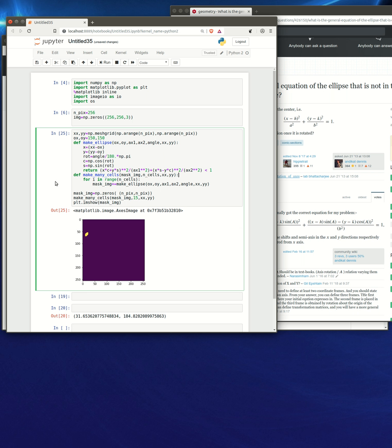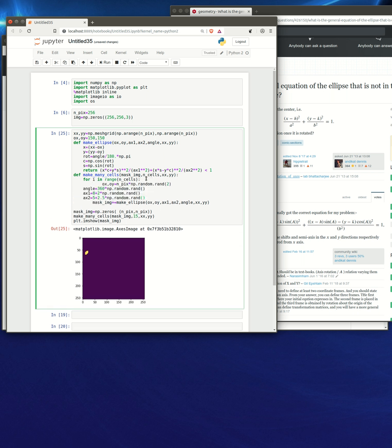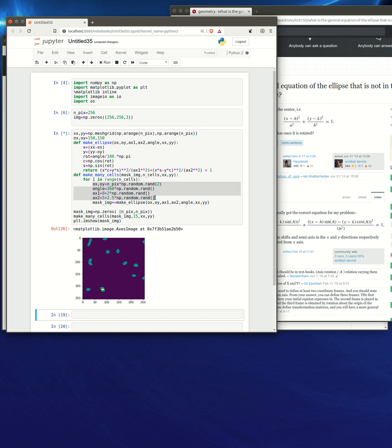of course we need to randomly choose the origin. And so now you can see that by adding this image, you have here overlapping areas. So the cells are overlapping. And then if we really want just the mask, then we just have to choose those pixels which are bigger than 0.